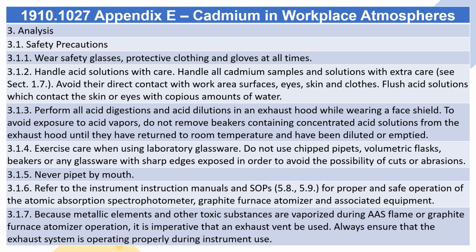3.1.3. Perform all acid digestions and acid dilutions in an exhaust hood while wearing a face shield. To avoid exposure to acid vapors, do not remove beakers containing concentrated acid solutions from the exhaust hood until they have returned to room temperature and have been diluted or emptied. 3.1.4. Exercise care when using laboratory glassware. Do not use chipped pipettes, volumetric flasks, beakers, or any glassware with sharp edges exposed in order to avoid the possibility of cuts or abrasions. 3.1.5. Never pipette by mouth.